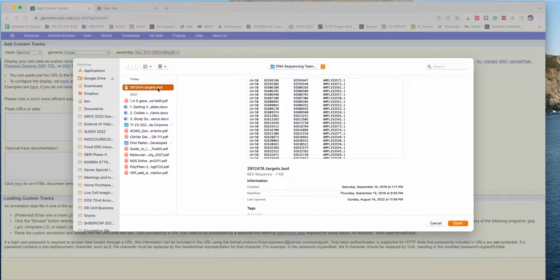So these are all the PCR products that cover all the exons of our genes. We would want to load this, and it's in the BED format. BED files are coordinate systems that can be loaded and superimposed on the genome in your genome browser, as long as these chromosome locations are derived from version 38 of the genome, which ours is.